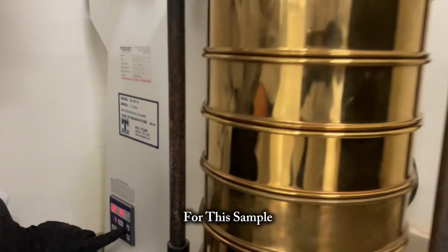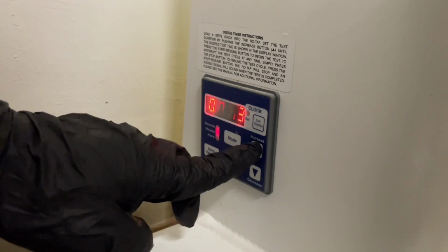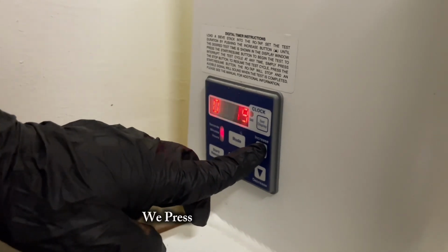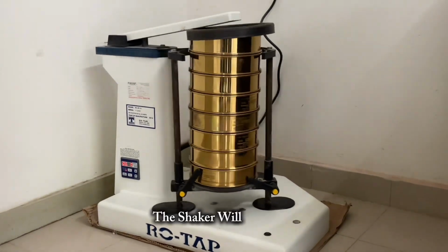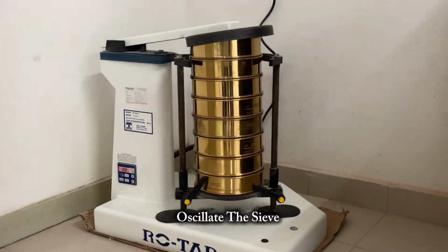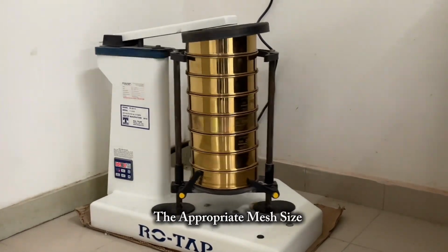For this sample, the set duration is around 20 minutes. Once everything is set, we press the start button and the sieving process begins. The shaker will vibrate or oscillate the sieves, allowing particles to pass through the appropriate mesh size.